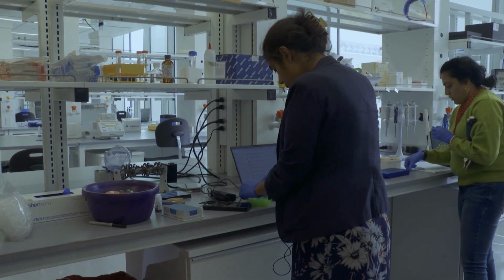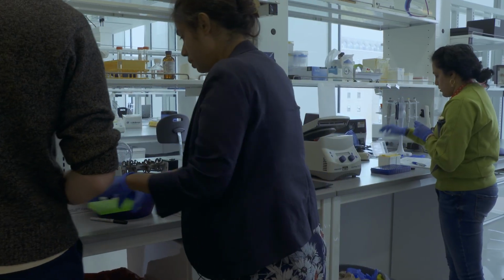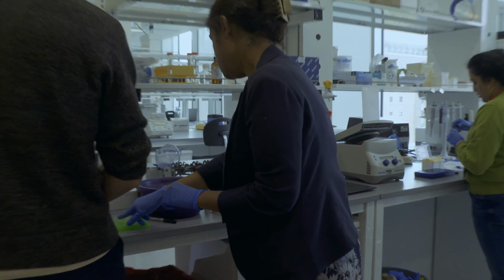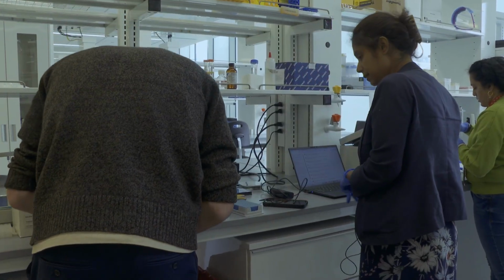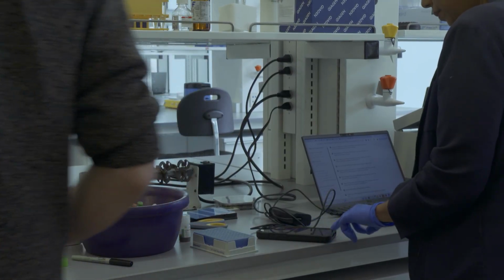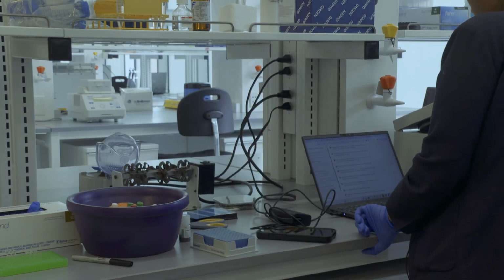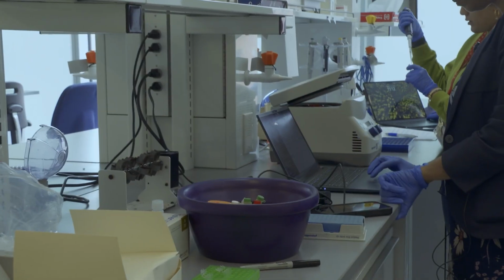Okay. If you can add your samples, these are 3 plasma. These are 3 CSF. Sure. So 1, 2, 3, 1, 2, 3, and then we can just document later. Yes, that's one. That's two. Okay, got it. Samples. What's the volume? 20.